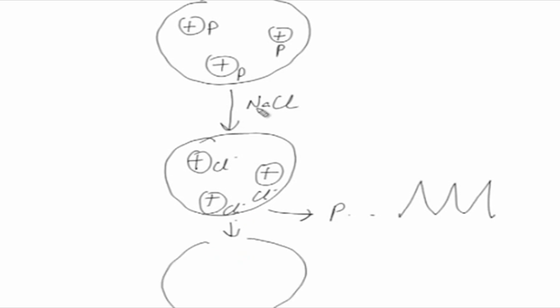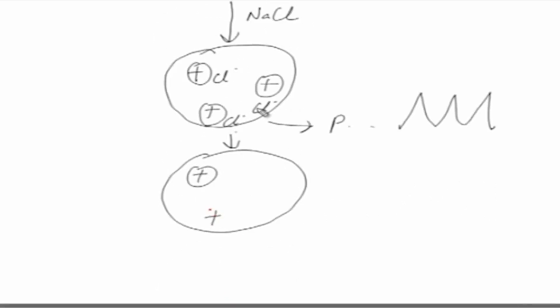So, again the simple buffer will be put in, and extra Cl or extra eluent will be washed off, and you will regenerate the column, which will be as the starting position, and so this resin could then be reused for another purification. So, this was in very simple way I tried to explain the mechanism of the ion exchange chromatography. Now, let us little bit see how the working of the chromatography is done.